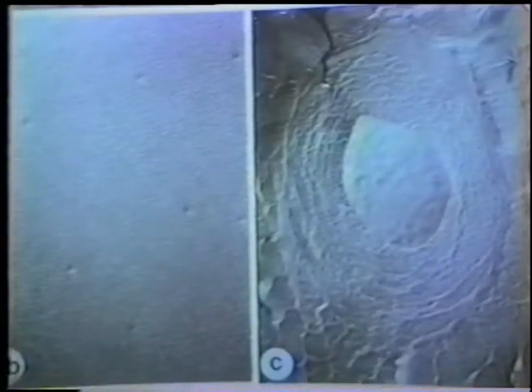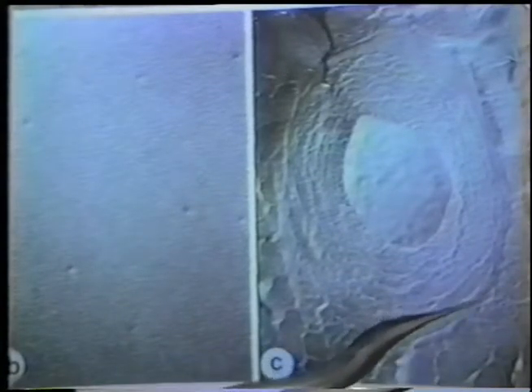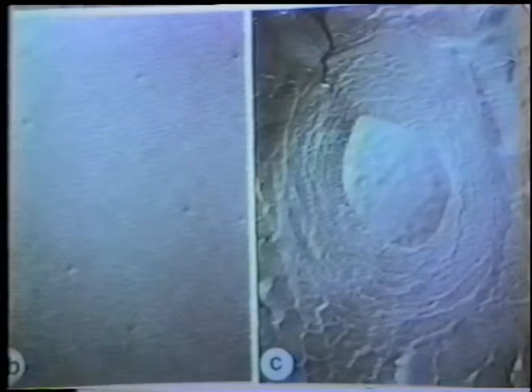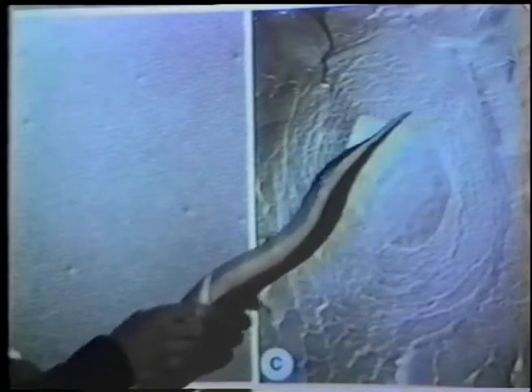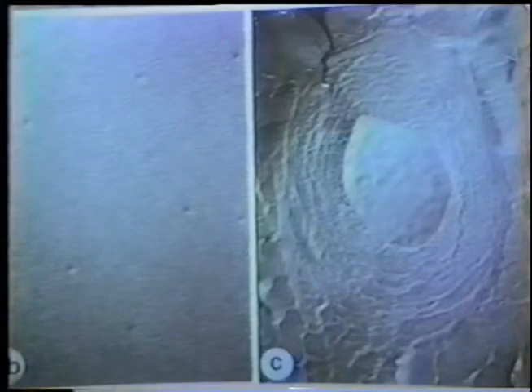But the ice is, can you see over there? The ice has been etched down where it was, and the eutectic domains have remained as raised ridges. And this is a slime layer around the cell here. And you can see it's not nice and uniform and formed as it is in the upper photograph. Okay.